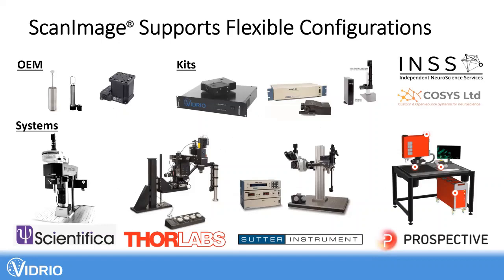You can go from kits; there are several companies that offer kits. You can work with INSS and COSYS to build a custom microscope, or do it yourself. But there are also finished scopes that Scientifica and others offer. One thing I would point out: there was some discussion over the last couple of days about how we get some of these techniques into the average user's hands.